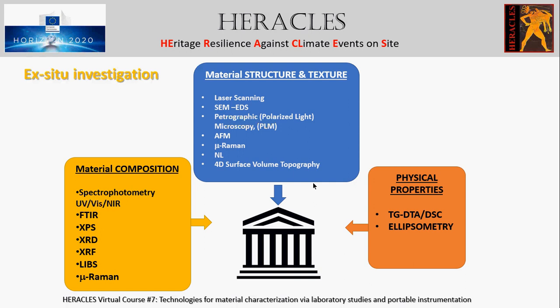Also, Fourier transform infrared spectroscopy, which is a useful ex situ technique in a sense that it supplements the material characterization by studying the vibrational modes of chemical groups present in the sample. It is extremely useful in characterizing organic materials used for stone or material consolidation.